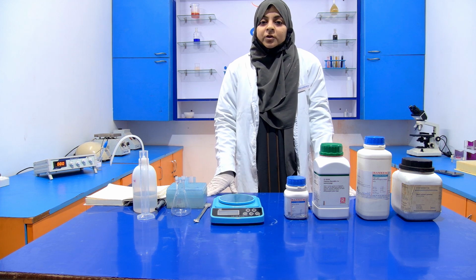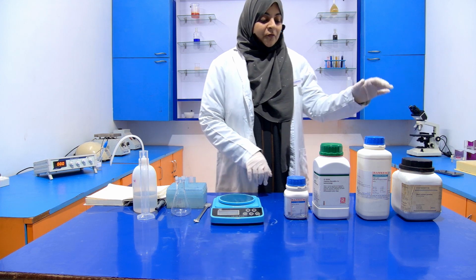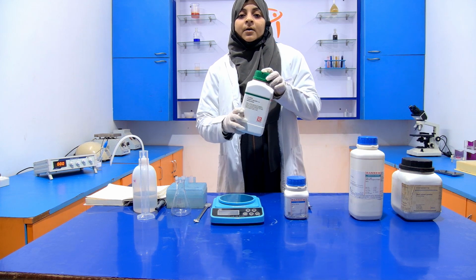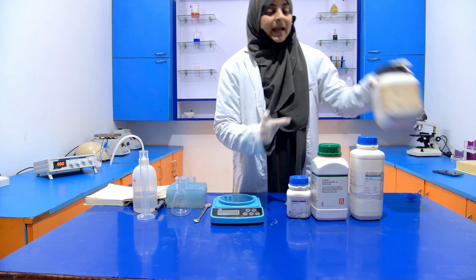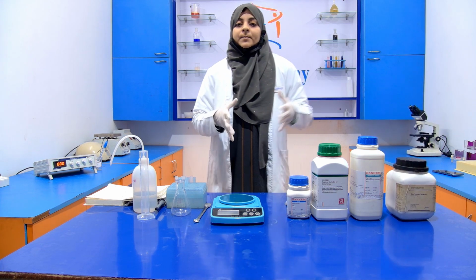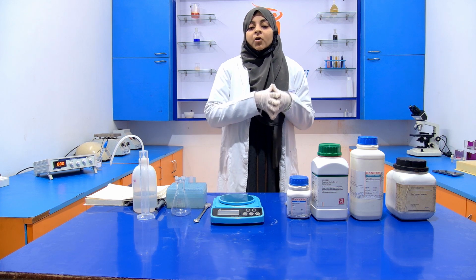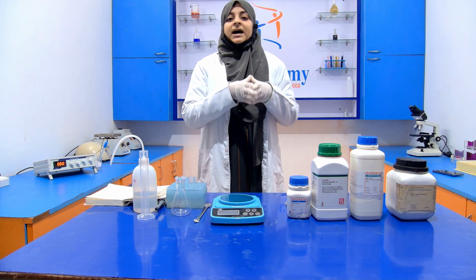So for the preparation of the nutrient agar media, we need some components. So first of all, we require agar. Then we require peptone, sodium chloride, and beef extract. If we have to prepare our media for 1 liter or 1000 ml, at that time the composition of these ingredients is as follows.